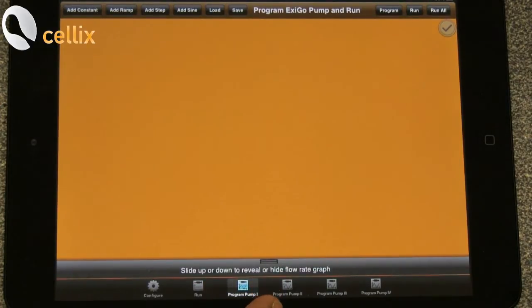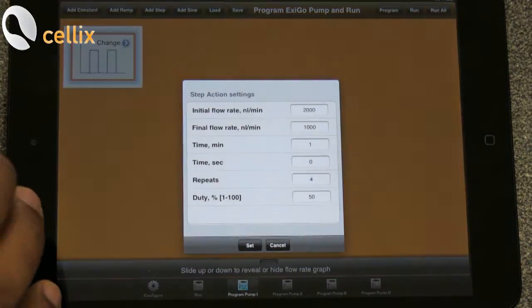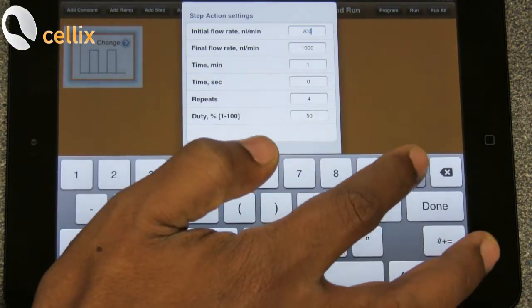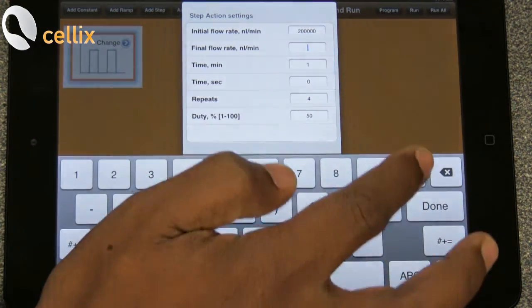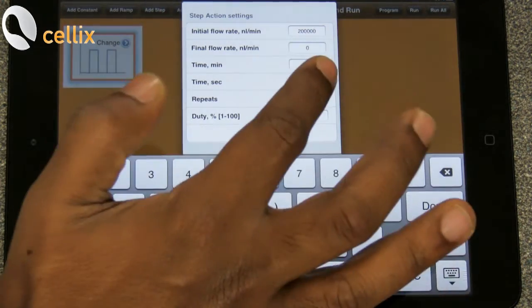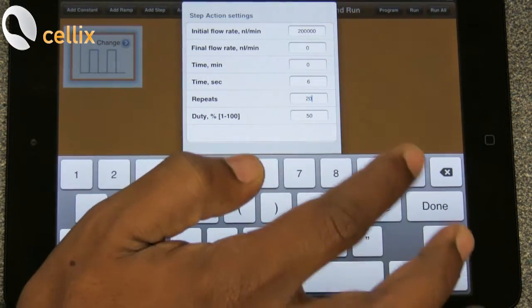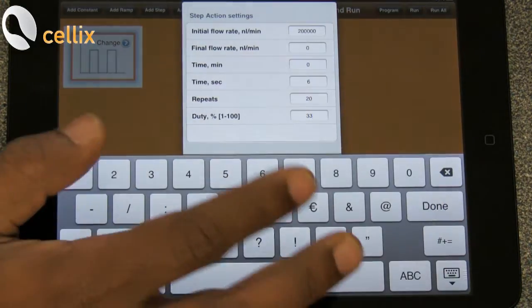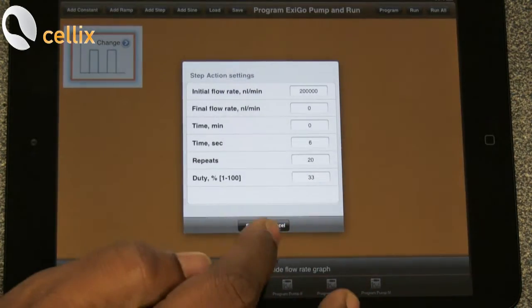So to run the pump, first we have to program the pump. To program the first pump, you click pump 1, then you go to add step. Then you have to enter the parameters. It will run at 200,000 nanoliter per minute and the next flow rate of 0, 6 seconds, 20 cycles and the duty time of 33 percentage. So the pump runs for 2 seconds and it stops for the next four. Click done, set.